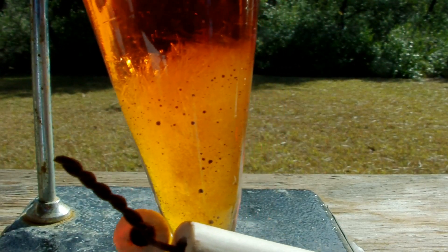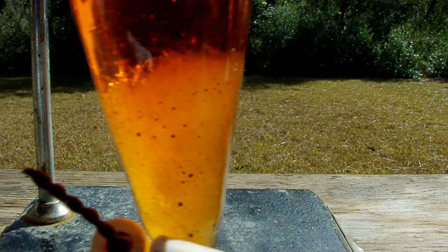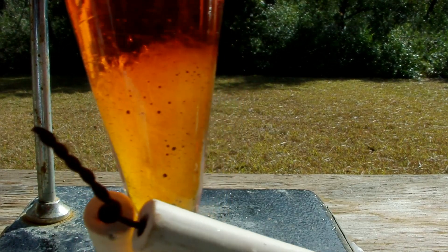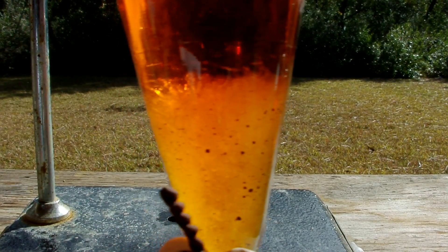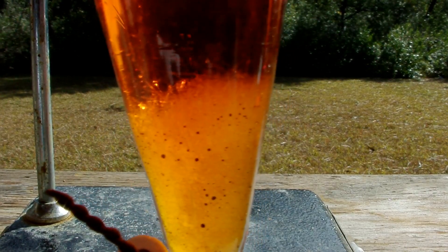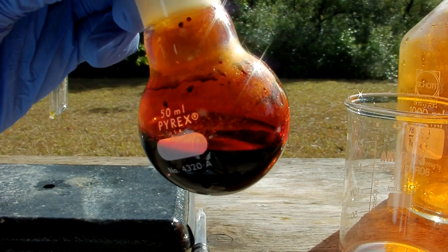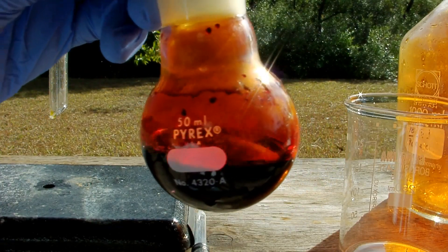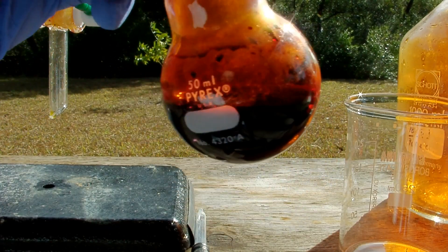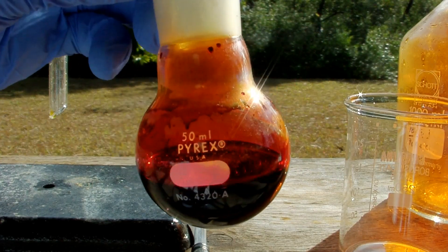It turns out that cloudiness wasn't a mixing layer — it's some kind of crystal, so something has precipitated. That may actually be impurities that were in the bisulfate. But here it is: my yield of elemental bromine. It looks like about 20 milliliters or so. You can see it's an incredibly dark liquid — it looks black with a very thick red vapor above it.